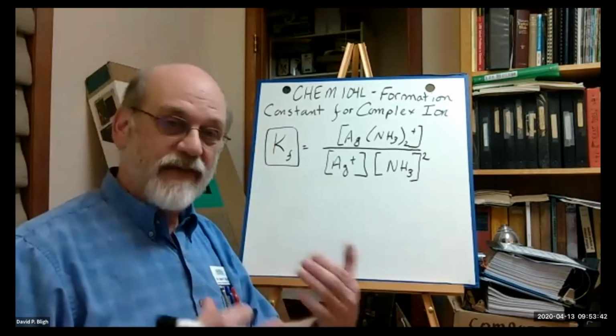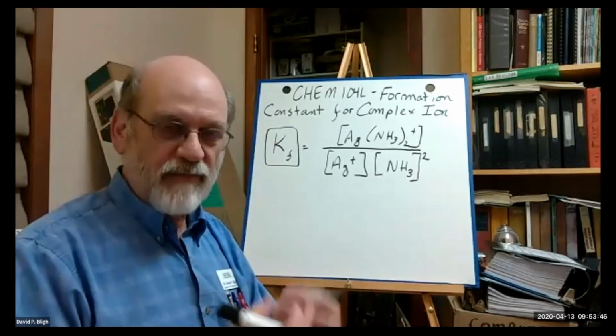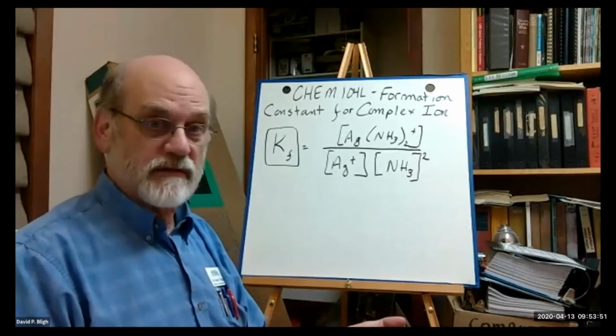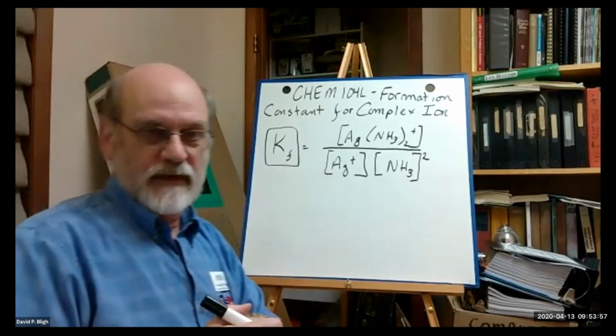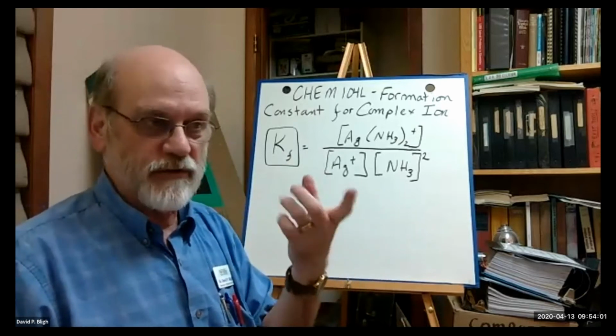So when you add those 2 together, the silver ion and the chloride ion combine and form an insoluble product. It precipitates. If you wait long enough, it'll settle on the bottom of the container. But in the beginning, it precipitates by forming a cloudy white silvery color.